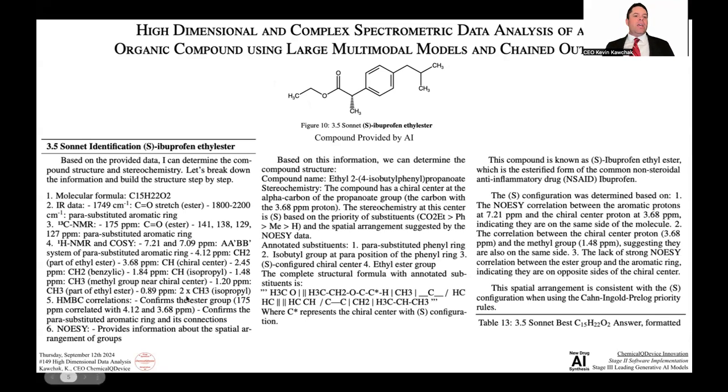but it's going to be different. So it went through a lot of the steps, with proton NMR and COSY, and you get a ton of information from the 1D spectra. And you also need to use the 2D spectra that I showed from before in order to get a lot of these, shorter range, like COSY is shorter range, and like a TOCSY is longer range, between protons. So, this information that it provided makes sense. And basically, it talks about the stereochemical assignment too.